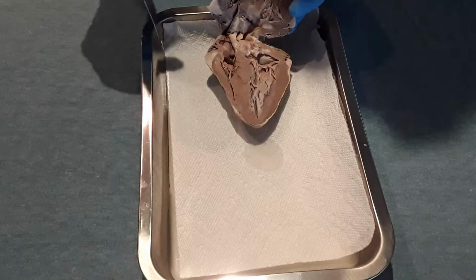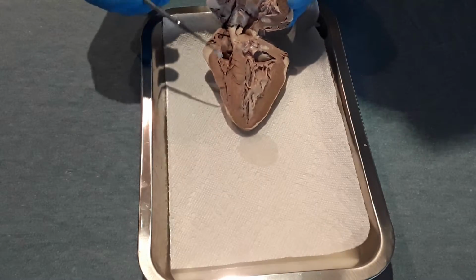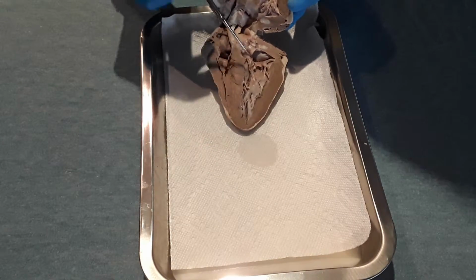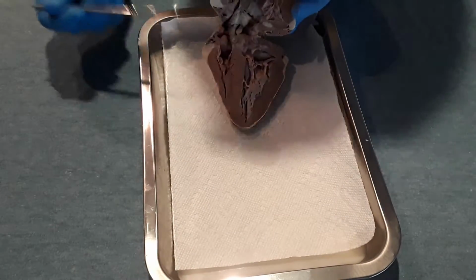This area right here, a little leaf, is the tricuspid valve. It leads from the right atrium to the right ventricle. This leafy structure here, you see a bit of it here and here, is the bicuspid valve. It leads from the left atrium to the left ventricle.